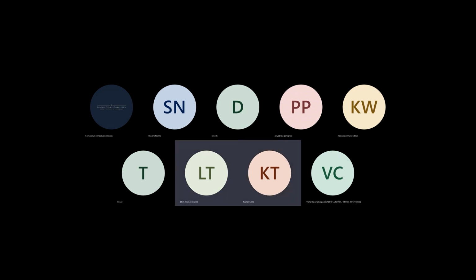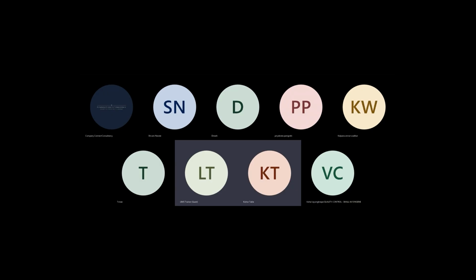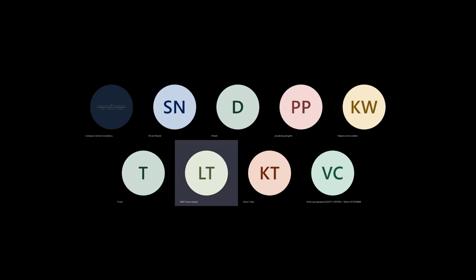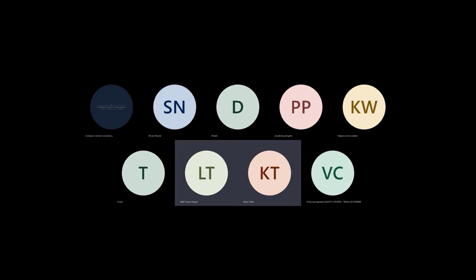See, running a query is nothing; clicking the execute button will run your query. But you should know how to write a query. You should know what a table structure is, what a table is, what a relational database is, what a primary key is, and what foreign keys are. The point is how to write a query in LIMS. Yes, I'll teach you the basics of SQL. I taught it to the earlier classes and they were very happy.